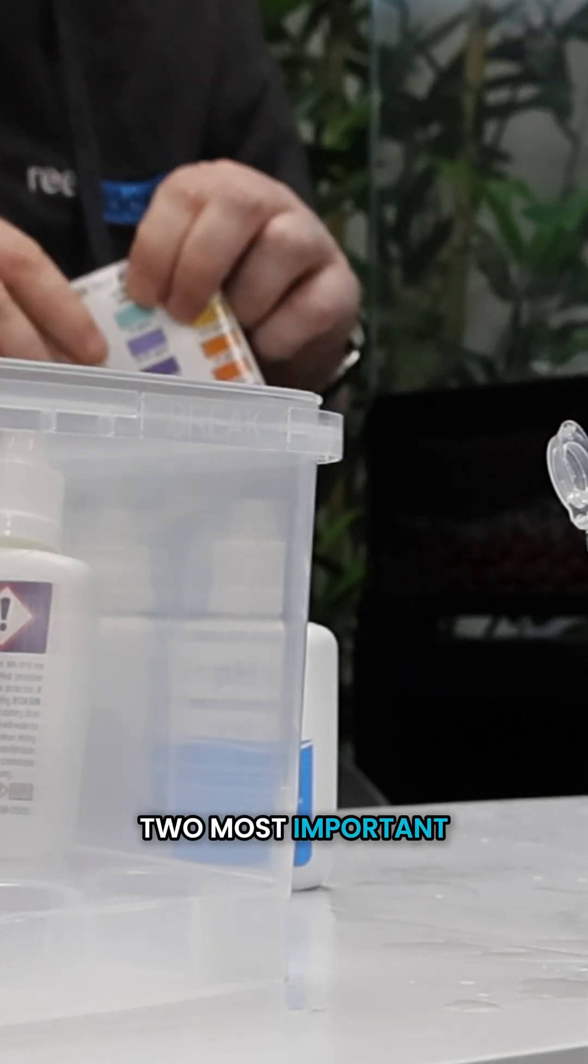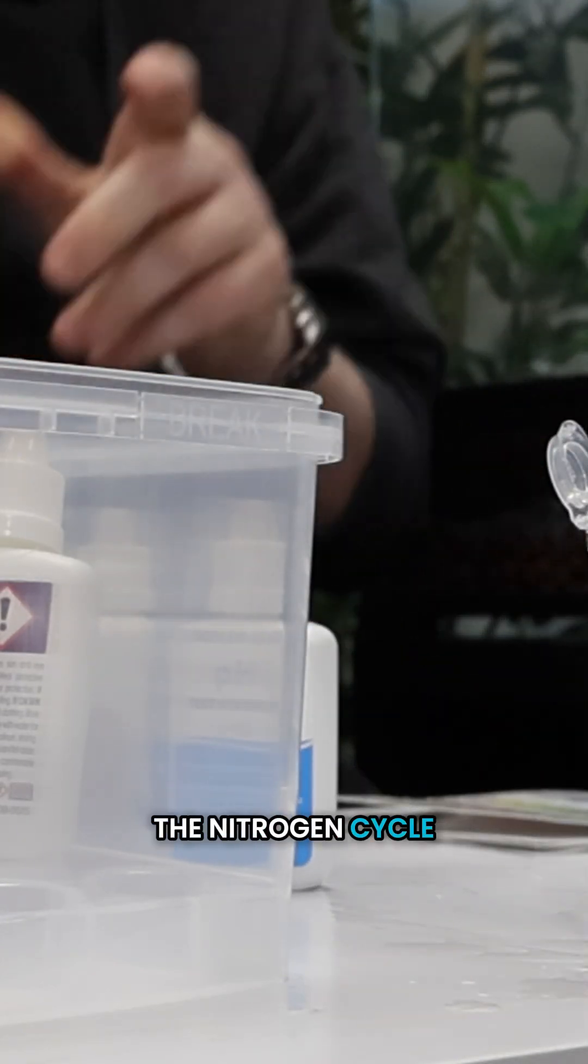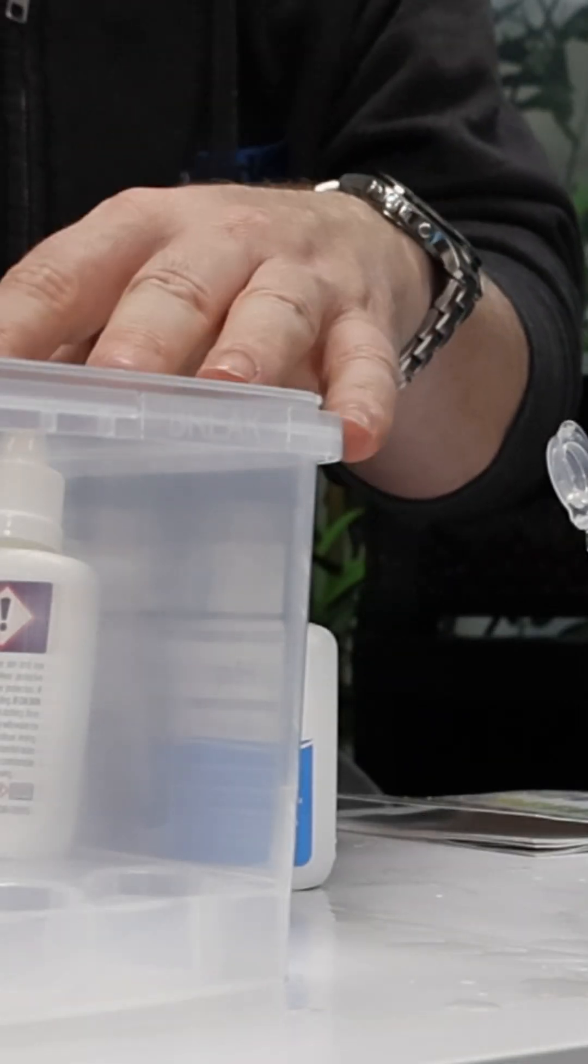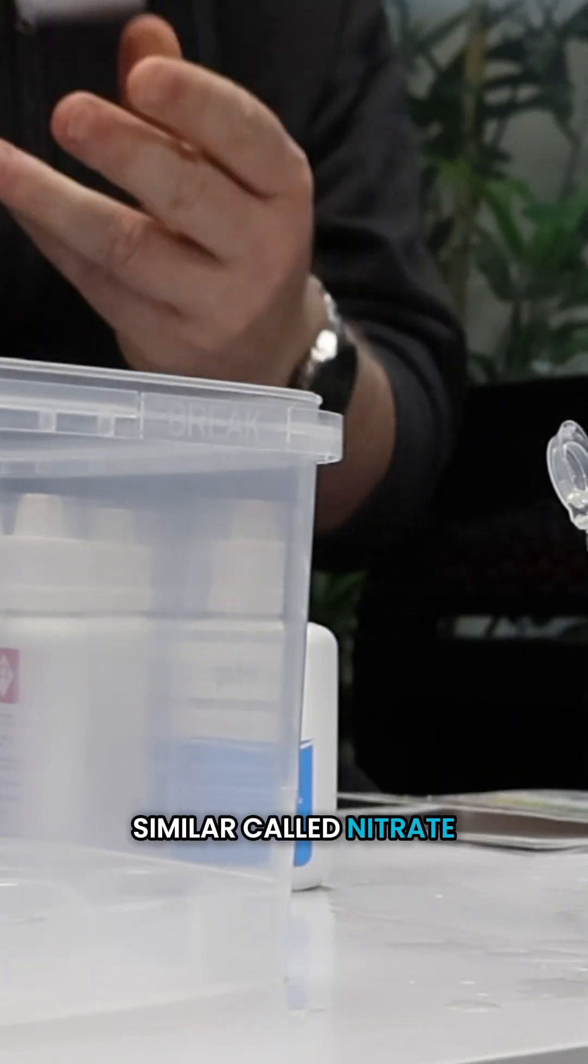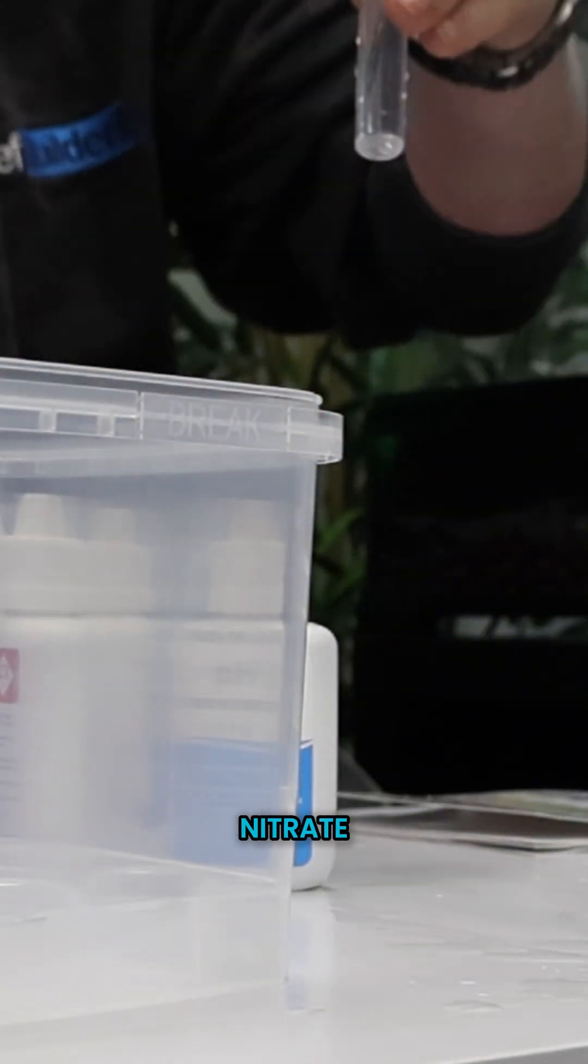And then finally, as part of the nitrogen cycle, those nitrite-converting bacteria convert into something sounding similar called nitrates. Nitrate is a byproduct. It's a lot less toxic than nitrite, but even so we still test for it. So 10 drops of bottle one.